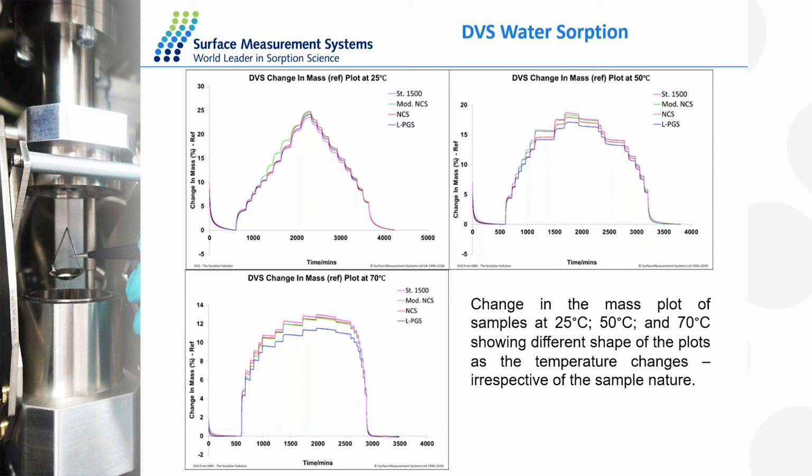If you're introducing, let's say, ethanol molecules, they compete with the sites for the water. So really what would happen is you'd have a decrease in surface area, and that's more common. However, in this case, our water molecules actually interacted with the bulk of our material, causing it to swell, and that's why we have a higher BET surface area.